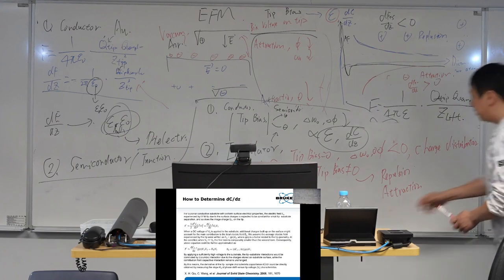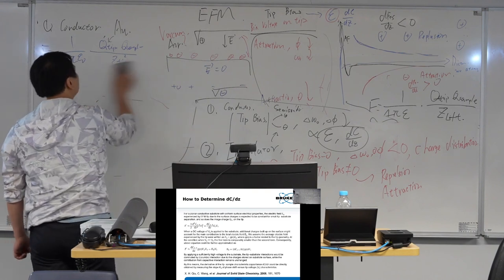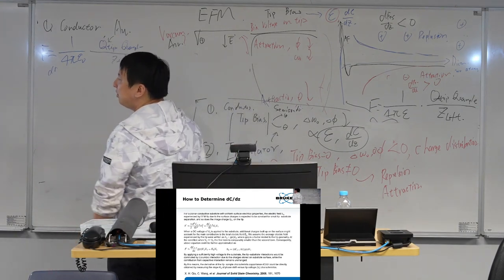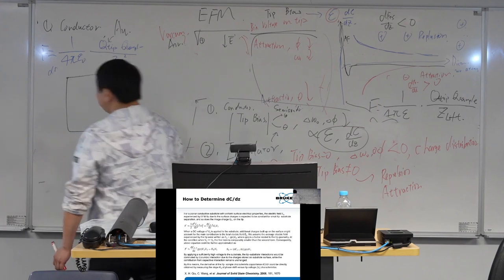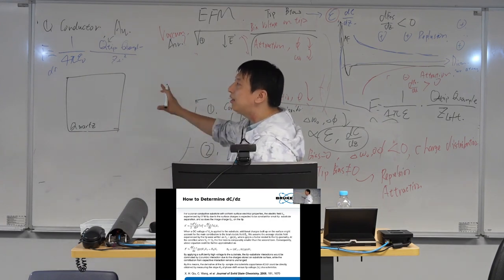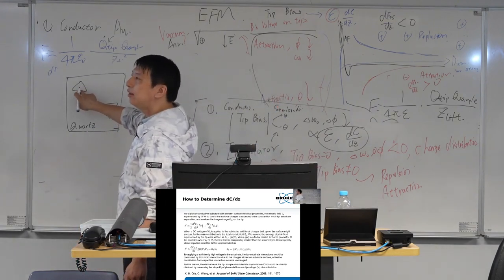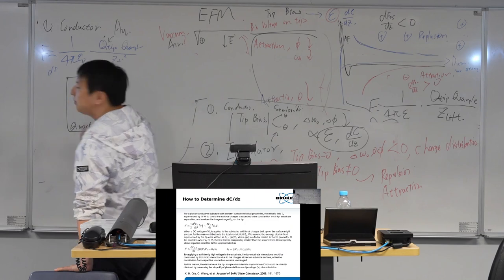Something like that. For example, in practical, we don't have this kind of sample very much, but let's use this as an example. For example, I have a quartz. That's my substrate. On the inside of my quartz, I have two graphene. And this graphene, I use my tip to inject some positive charge.